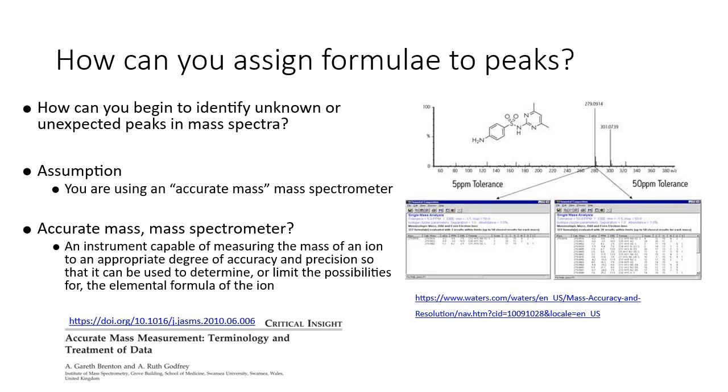In all these cases, there could be a huge number of peaks you need to identify, and there's no way you'd be able to buy standards for all of them. So attempting to assign those peaks using their accurate masses may be the only potential strategy open to you.